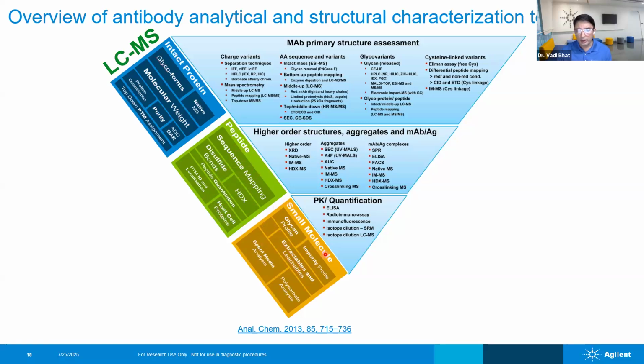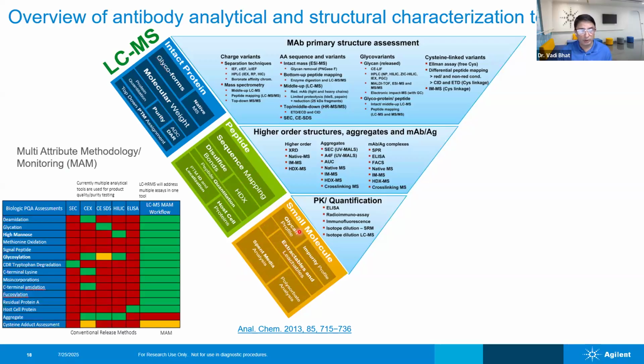And also somebody wants to analyze the small molecules, including polysorbate, cell culture media, and leachables, as well as host cell proteins, which are peptides. Even glycan profiles, once you release them, are like small molecules. And of course, fragile ones as well.